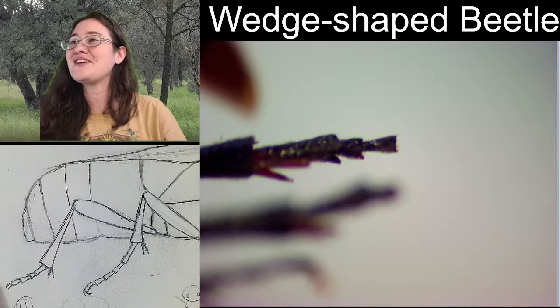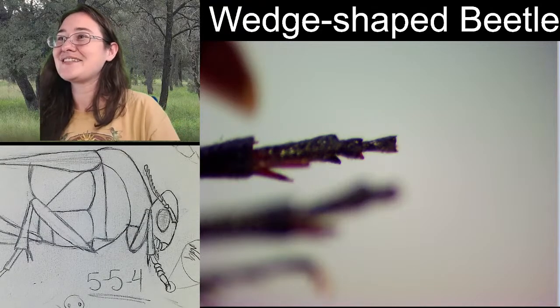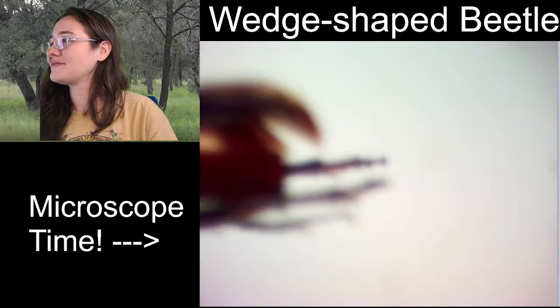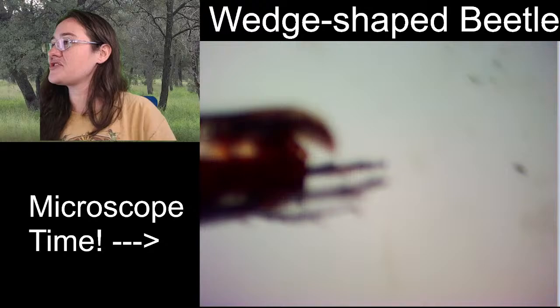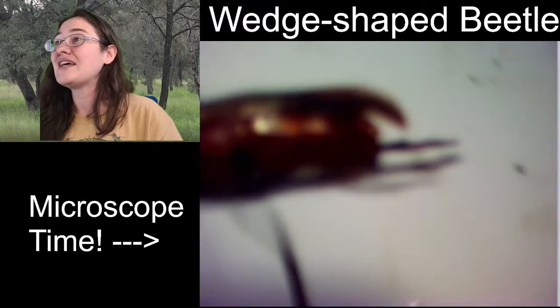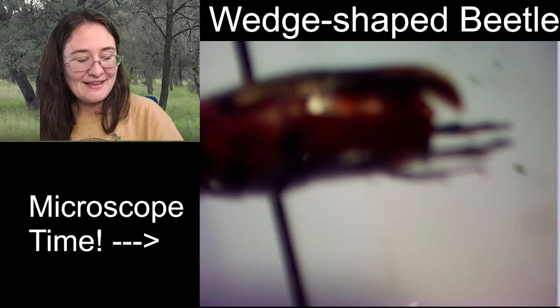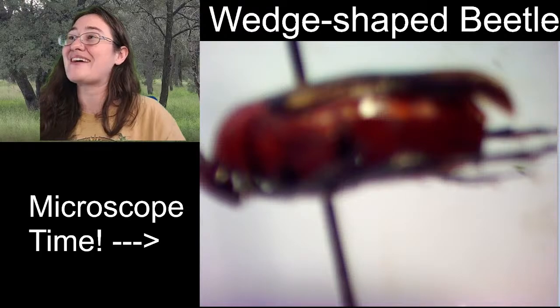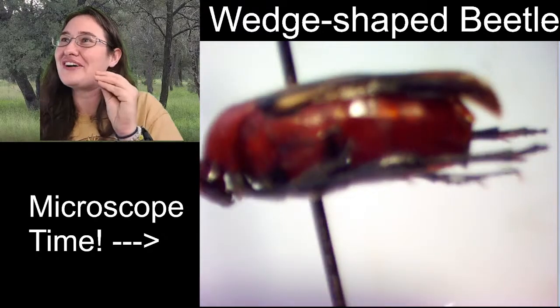Oh, he's so cute. Interesting, the tarsal segments on the middle leg are so much longer and more slender than the other legs. That is interesting. I wonder if it has something to do with their balance because they're so tall.